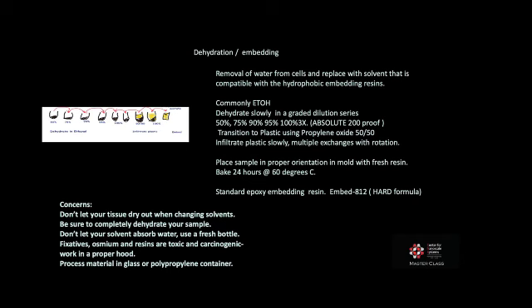So dehydration, why are we dehydrating? Biological cells are essentially water balloons. We need to remove this water so that we can go into the vacuum of the microscope, but also so that we can penetrate it with the hydrophobic embedding resins.